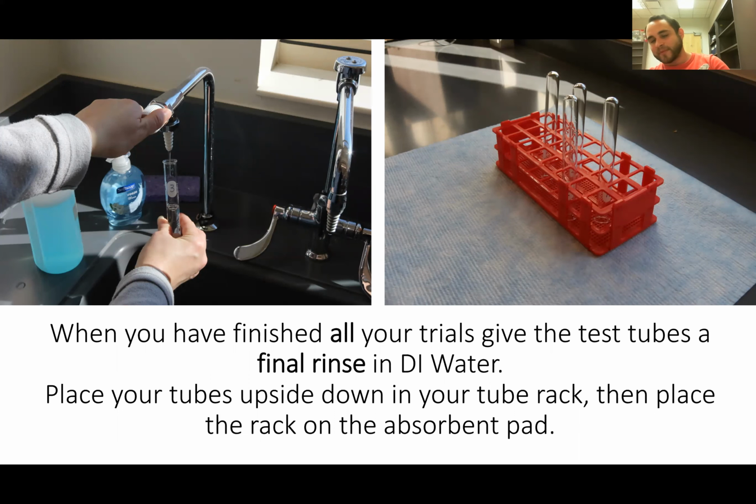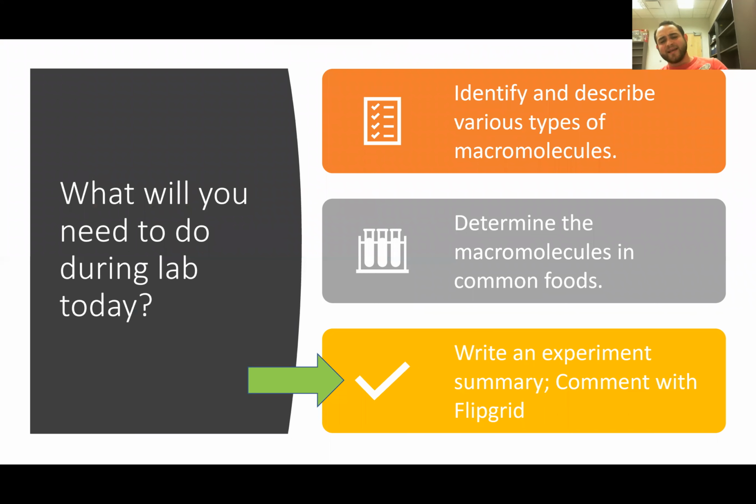Again, this is a very basic structure of the procedure. In the lab summary, you guys are gonna go, okay, first we labeled the tubes, then we put there 2 milliliters of each reagent, then we did this, then we cleaned the tubes, and then we put them out to dry. That's the procedure. You can use this PowerPoint as a guide to write that procedure.